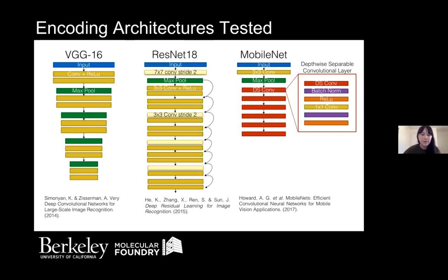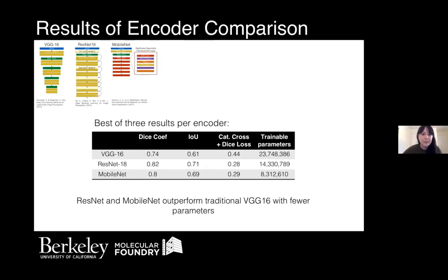And so this was something that we found to affect our accuracy previously in our custom UNet architecture, and we wanted to compare it on these that are out in the community for everyone to use. And we actually found that the architectures with the fewest parameters actually perform best, whether or not you look at the intersection over union type error metrics or just the cross entropy loss.